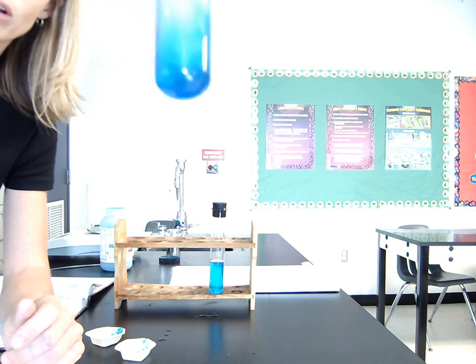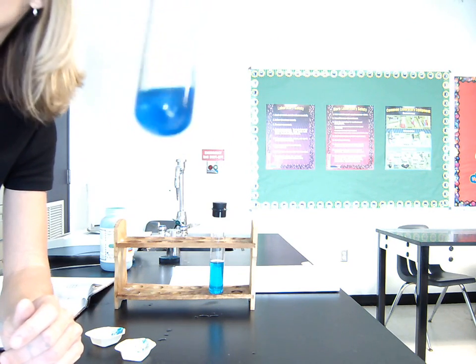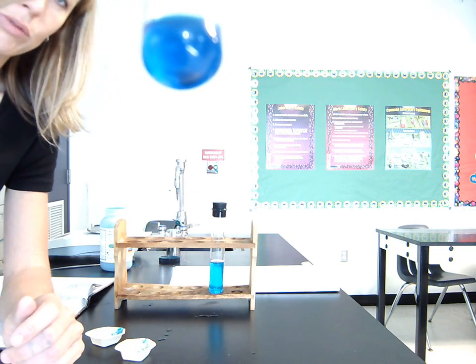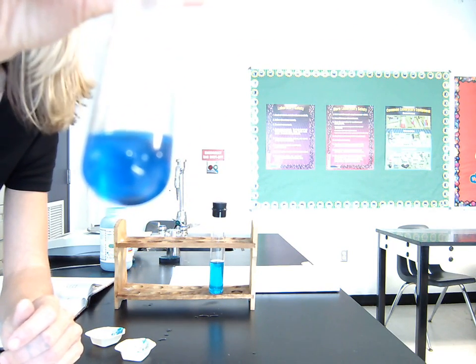Now, I can tell you, and you might want to take my word for it just because of timing, no matter how long I shake this, I could shake it for the next hour and a half, that blue stuff that's left in the bottom, I'll let it settle out again so you can see it on that side. There it is. That dark spot in the bottom of the test tube, that's blue solid that is left undissolved. And my point is that no matter how long I shake this, it's not going to dissolve. That 5 cubic centimeters of water will not dissolve any more blue stuff.